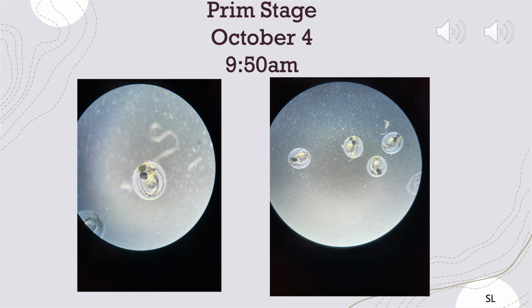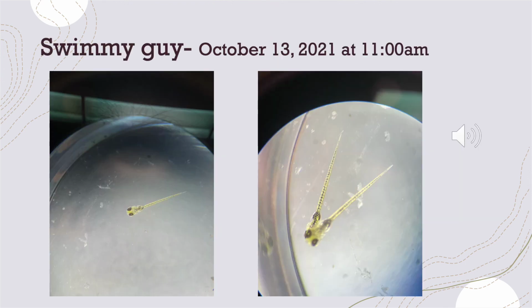Along with the physical appearance, they also were responsive to touch, and they had lots of spontaneous movements going on, more than before in the somite stage. We now have a fast little swimming fish.